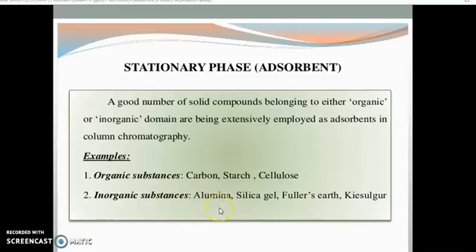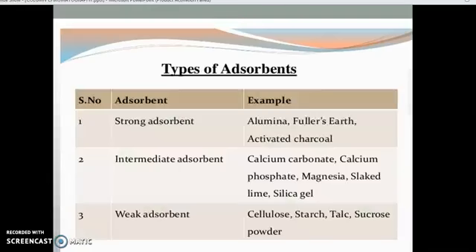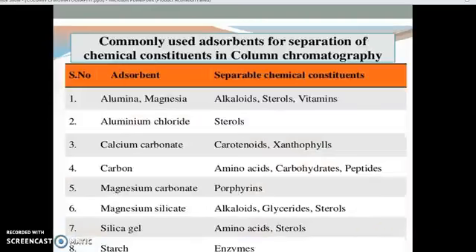These are the compositions we need to prepare the adsorbent in column chromatography. So here we have selected a certain principle, advantages, disadvantages, and mobile phase and stationary phase selection on the TLC plate. Now in this way, we just look at the separation.